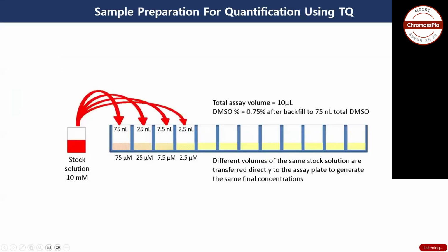And I think it would be good if you prepare them fresh every time, and you know that you did it right. Sometimes the concentration or the metals kind of fly away. That's why I suggest, if you want to prepare 5 different standard solutions over some time, it would be good if you do it again from your stock.